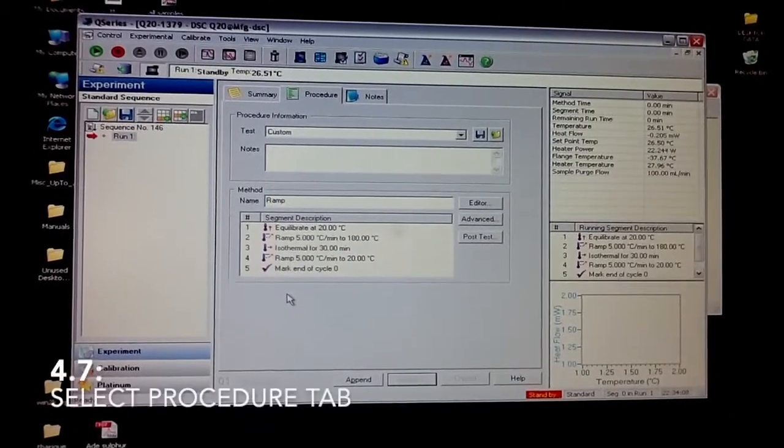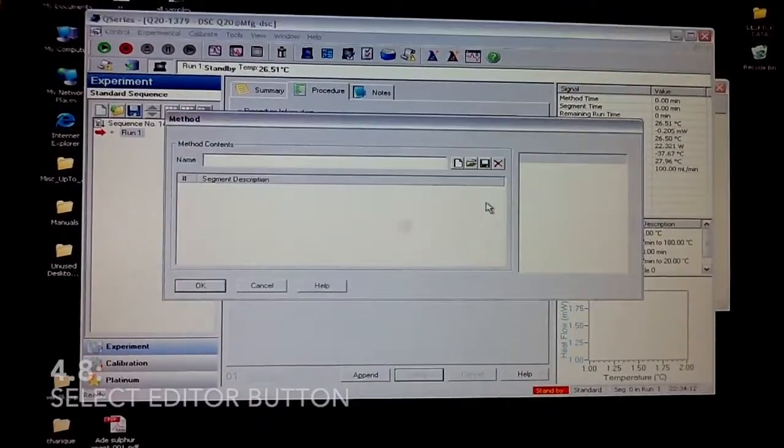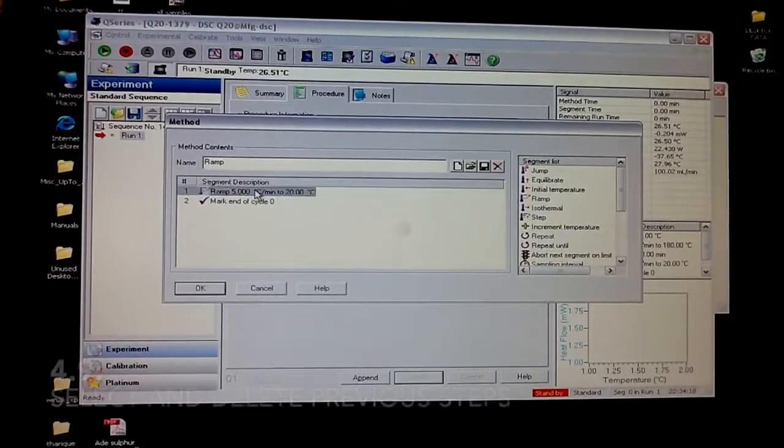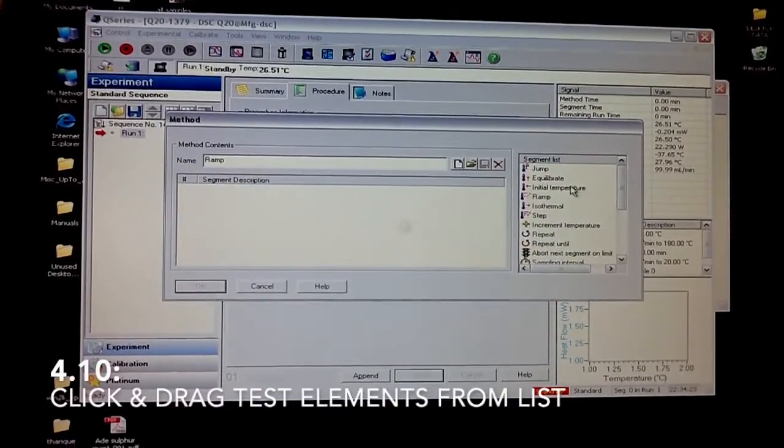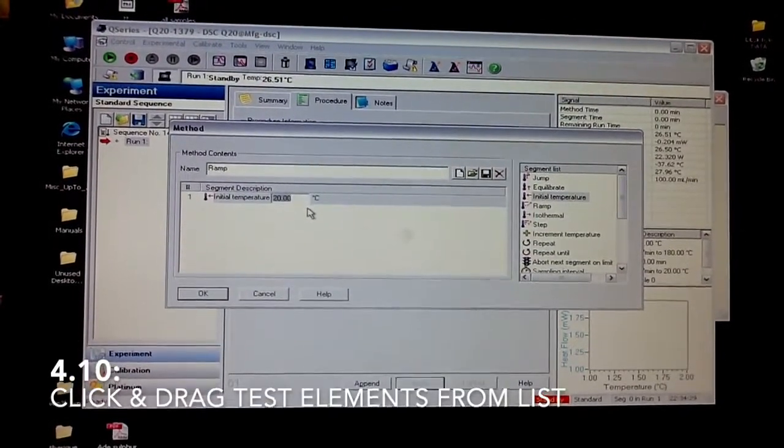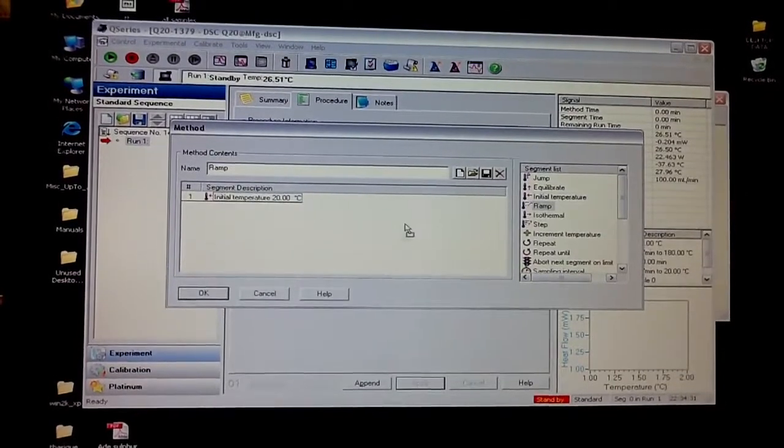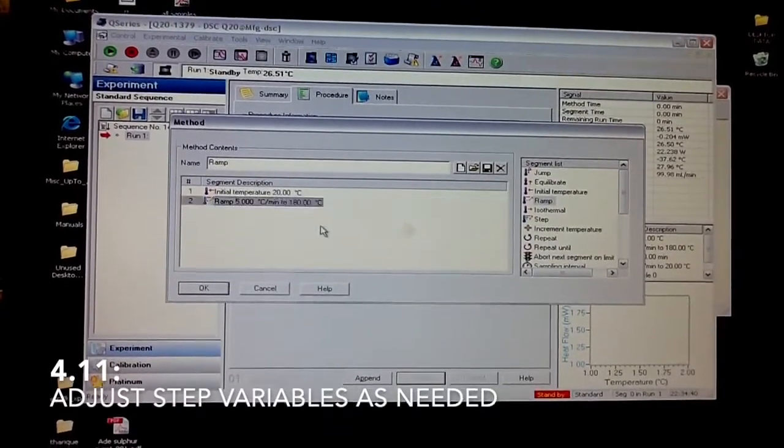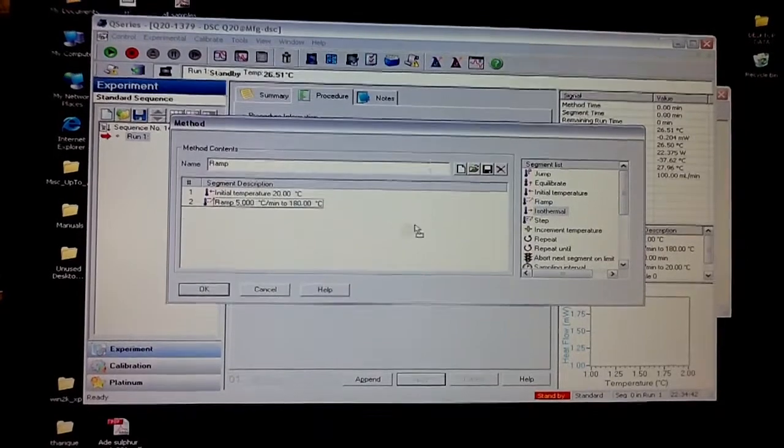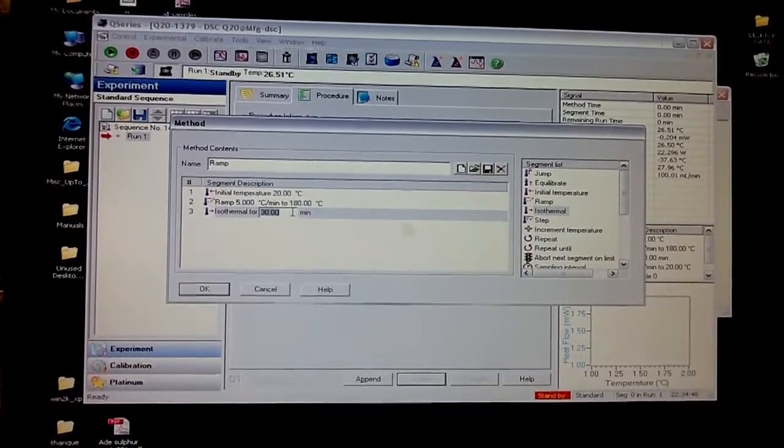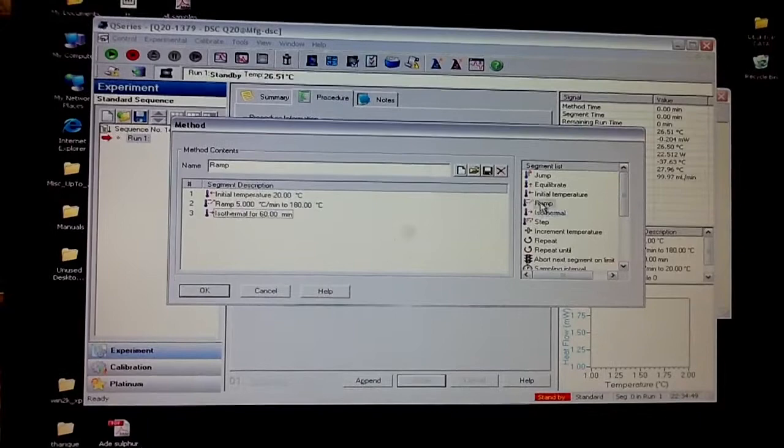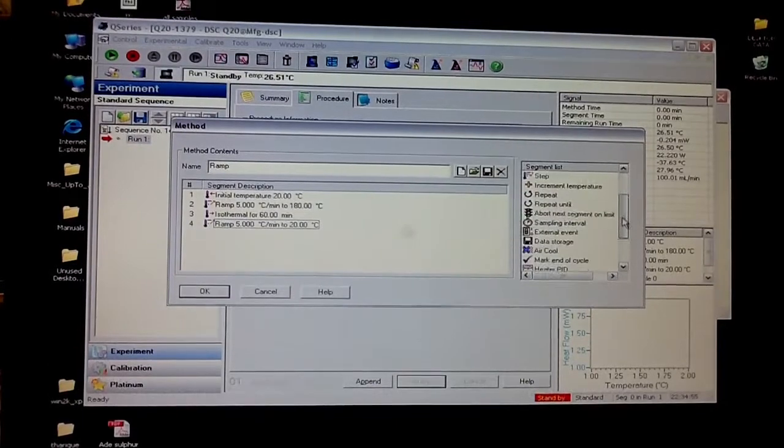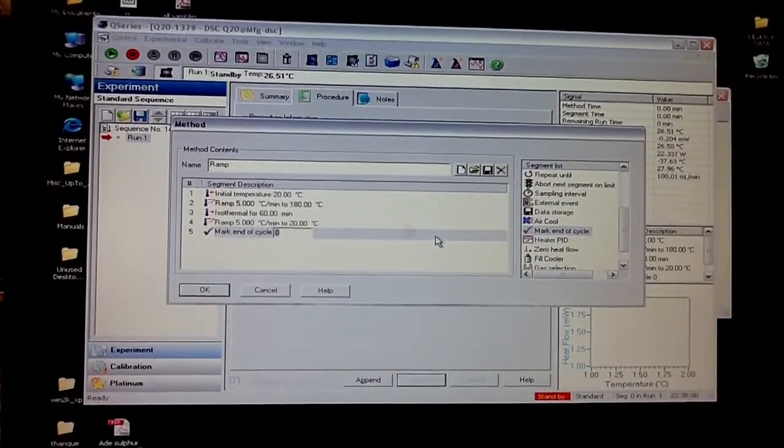In the Procedure tab, you can set your test up by hitting this Editor button. You highlight it and hit Delete to take away a previous test. Usually a test will initialize a temperature. Then you'll put in a ramp at about 5 or 10 degrees C up to your target temperature. You'll put in an isothermal step to hold for however long. Then you will put in a ramp to take it back down to 20 C. And then you end this cycle here.